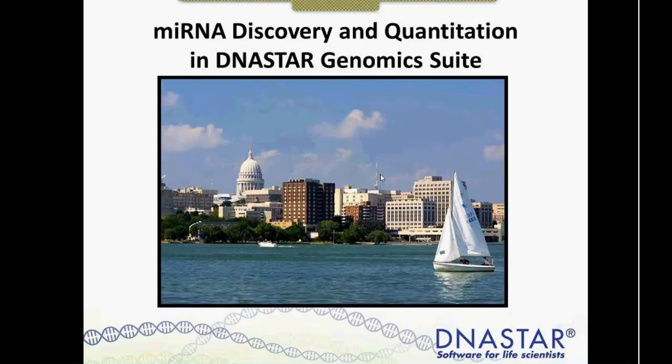This will be a little bit different than some of the webinars in the past, where there's generally one workflow that we start from point A and go to point B. Here we're going to have some optional workflows, so I would imagine there will be some questions. I'll try to explain the different workflows in as much detail as possible. But certainly, if you do have questions, send them in to Jackie and I, and I'll try to clarify and answer your questions directly.